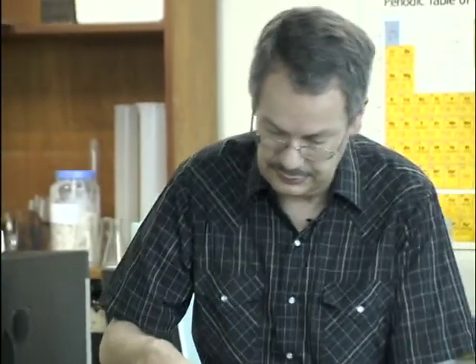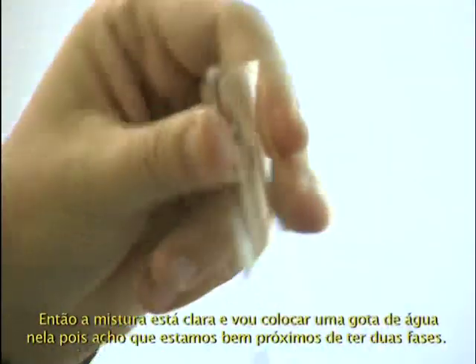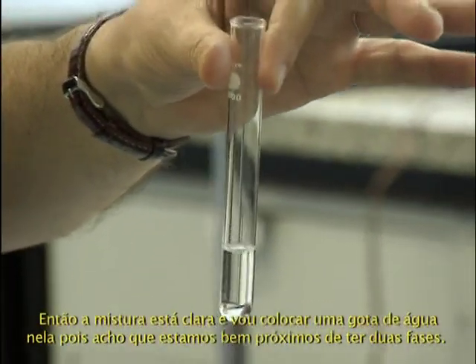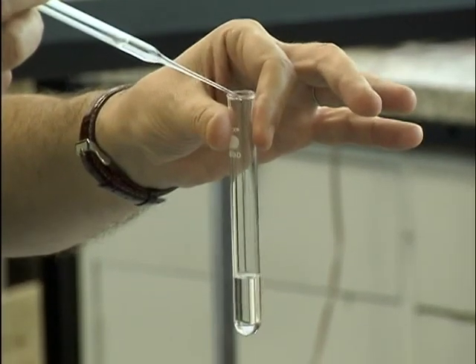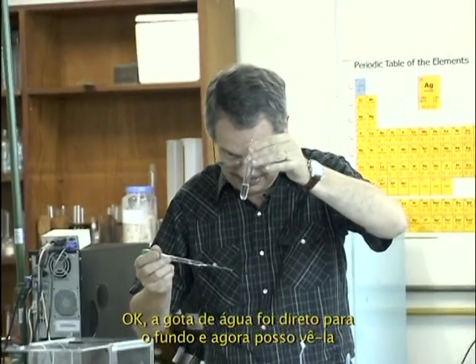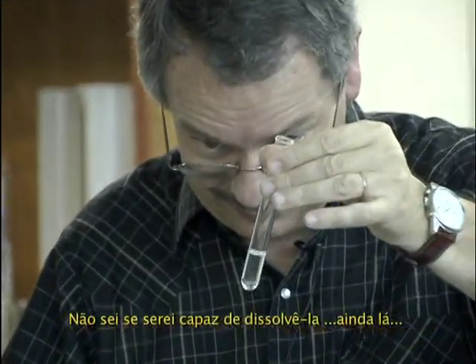Put zero again, and now I will drop water in this mixture. This is water. Yes. So that's clear. I put 1 drop of water in it because I think it's very close to when we get 2 phases. Okay, the water drop went right to the bottom, and now I see it, but I don't know if I will be able to dissolve it.